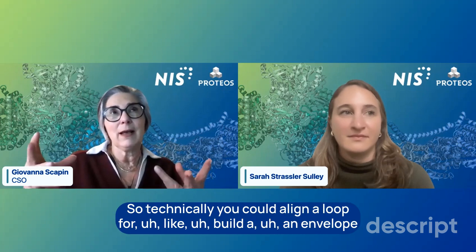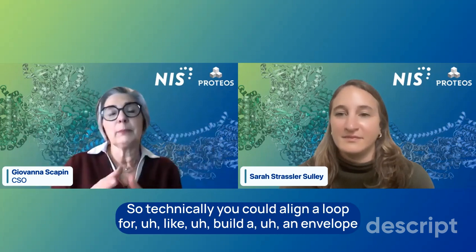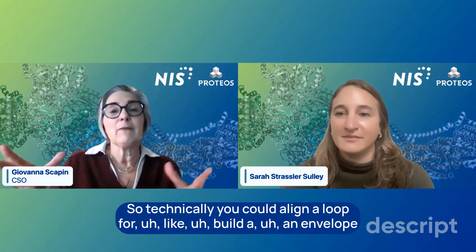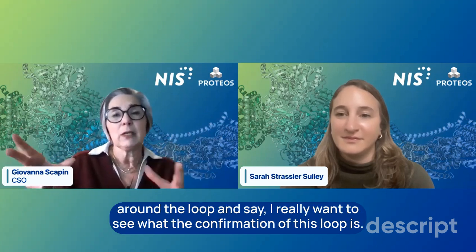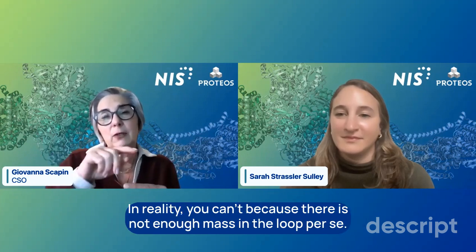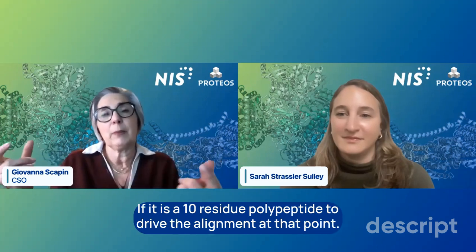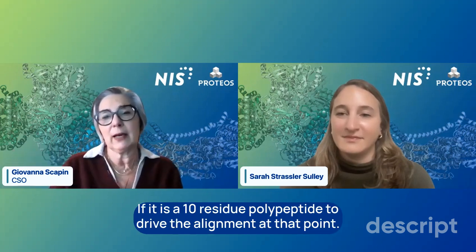So technically, you could build an envelope around a loop and say, I really want to see what the conformation of this loop is. In reality, you can't because there is not enough mass in the loop per se, if it is a 10 residue polypeptide, to drive the alignment at that point.